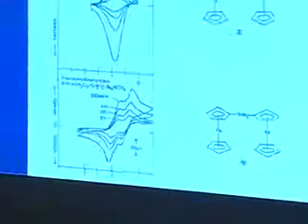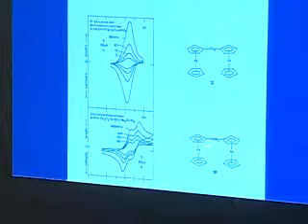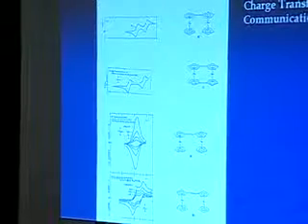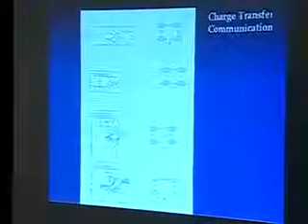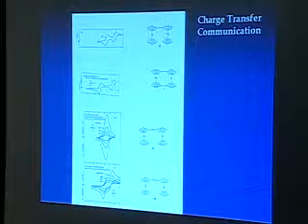On the other hand, the silicon has these fairly low-lying d orbitals, and they might facilitate communication between the two aromatic rings. And sure enough, when you put the silicon in there, you start to see the communications coming back. It's not a big splitting compared to what we saw up there, but clearly there is a splitting. And so the two ions now know when one is oxidized and the other is reduced. So both distance and the nature of the orbitals, things you know now, are important. It wasn't so obvious what those different parameters did in the late 70s when that work was done.